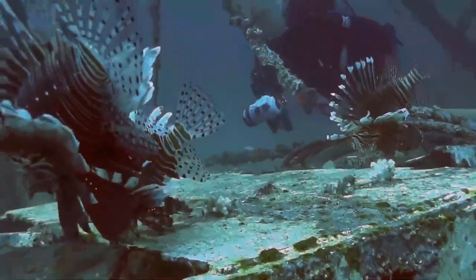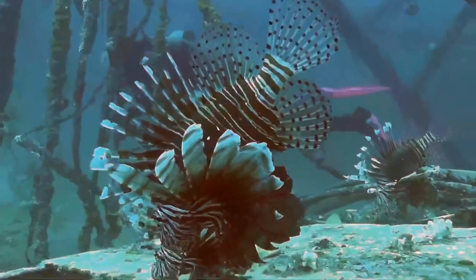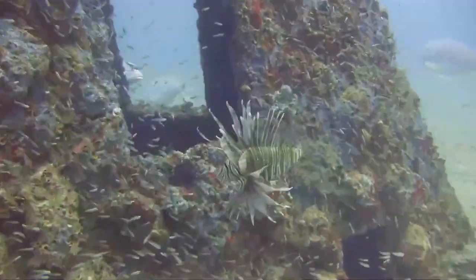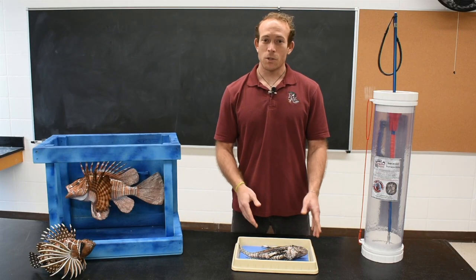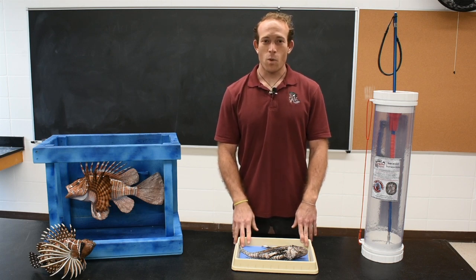Lionfish are a threat to native ecosystems because they reach sexual maturity in one year, they feed on over a hundred different prey items, they can tolerate a wide variety of habitats, and they reproduce every two to four days. Today we're going to dissect a lionfish and use dissection as a tool to learn more about the characteristics of this invasive species and to see why lionfish are the perfect marine invader.